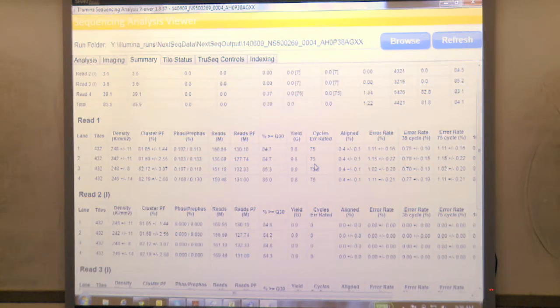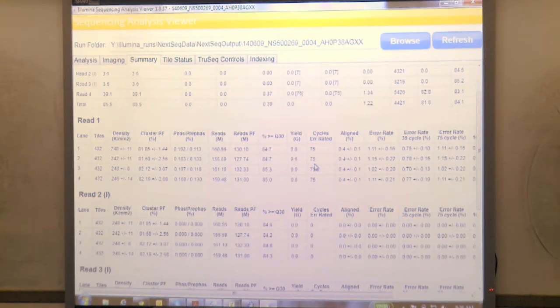The error rate is calculated for 75 cycles - the length of my read one. The error rate is calculated based on a library called PhiX. Everything we sequence, we spike this library in because PhiX has a very small genome that was really well sequenced before. The software is able to align it to the genome in real time and then do calculations for cluster density, pass filtering, and error rate. Based on the error rate, you can know if your run was good or not.